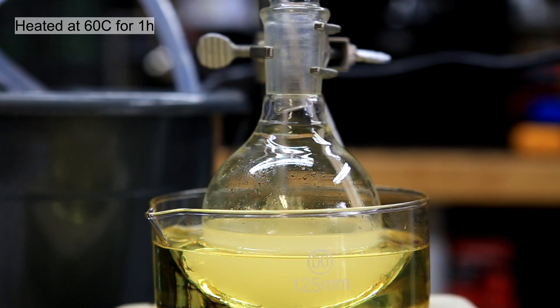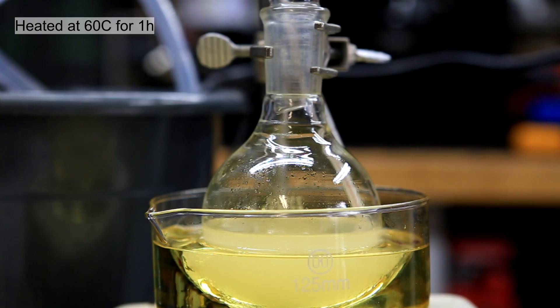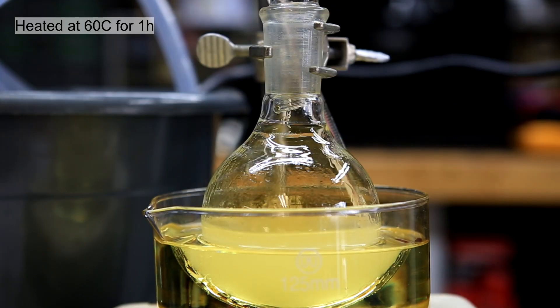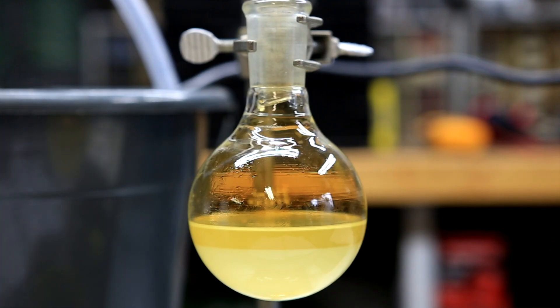After all the benzene had been added, the solution was a faint yellow color and was heated to 60 degrees Celsius for one hour. It is important that the solution is not heated much more than 60 degrees Celsius. After the one hour, the solution was allowed to cool and you can see that two layers have formed.